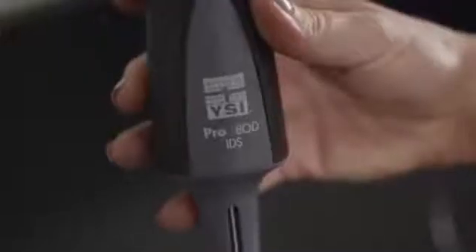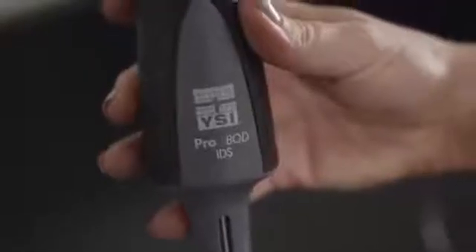The IDS includes self-stirring BOD, pH, ORP, and conductivity sensors. The IDS OBOD self-stirring optical BOD probe, powered by the instrument, has a built-in sensor guard to protect the sensing tip from damage while placing it into BOD bottles.